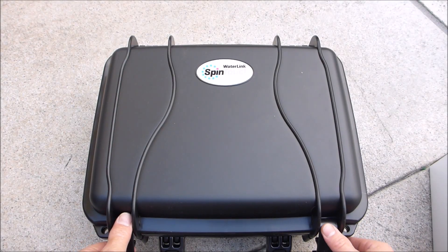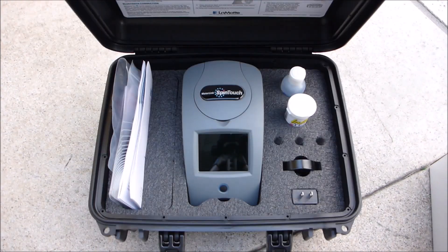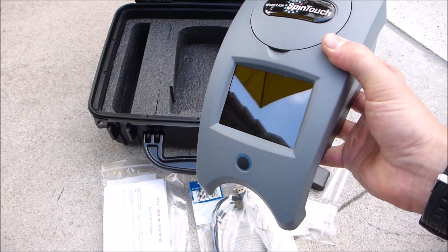In this video I'm going to show you the LaMotte Mobile Waterlink Spintouch, and included with the Spintouch is everything you're going to need to operate it.